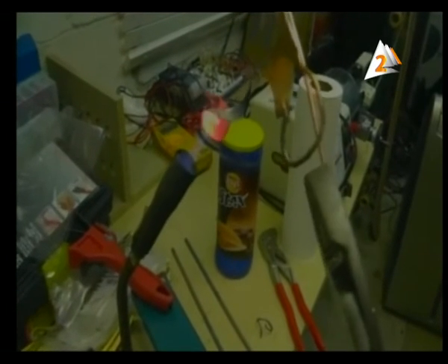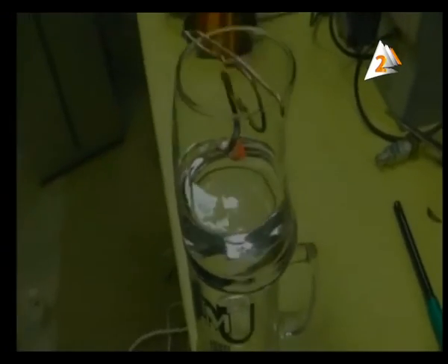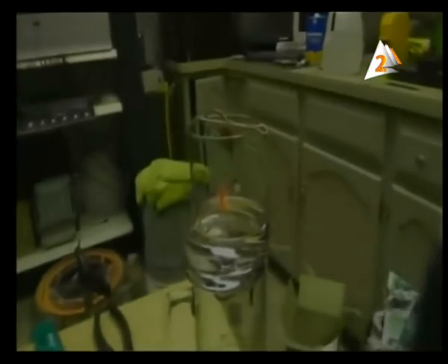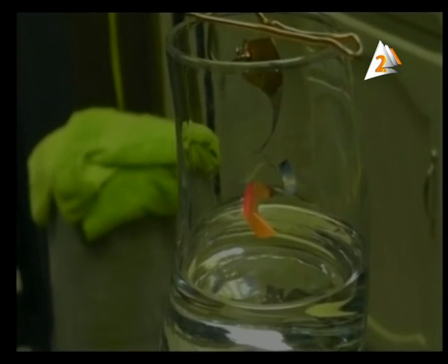Look, during heating, the color of the copper changes. Now, put it in acetone and be careful. Look down. Do you see what happened? Here we have the heat energy increase in the copper after burning this piece, and the reaction between the acetone and the copper increases. Why? Because the heat energy increases the collision between the particles of copper and the acetone. It makes the reaction increase.